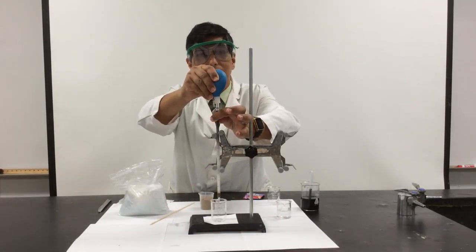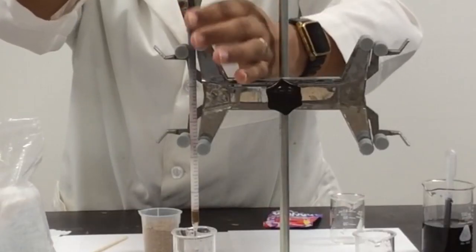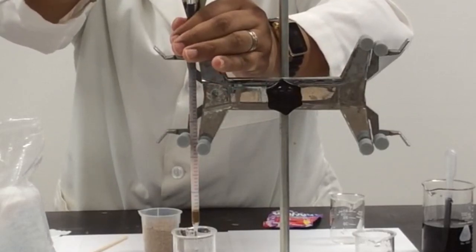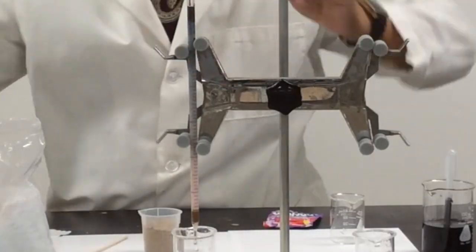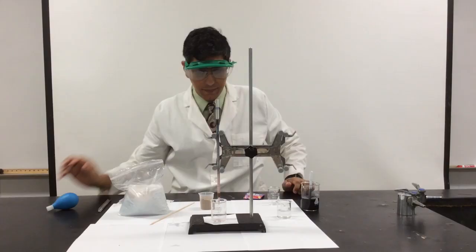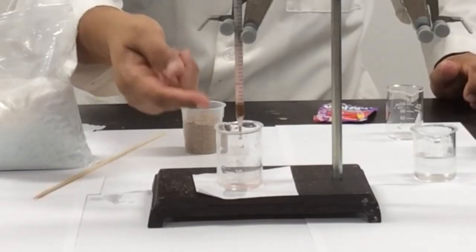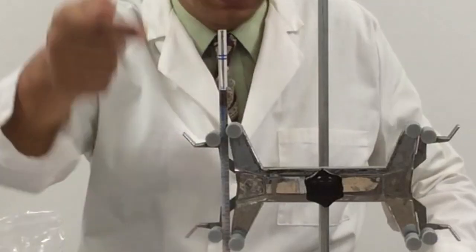Hopefully you'll start to see a fairly significant separation. Can you see some colors separating out already? Here toward the bottom of the column, it seems like the red dye is separating out more quickly, and then the blue dye is up here.